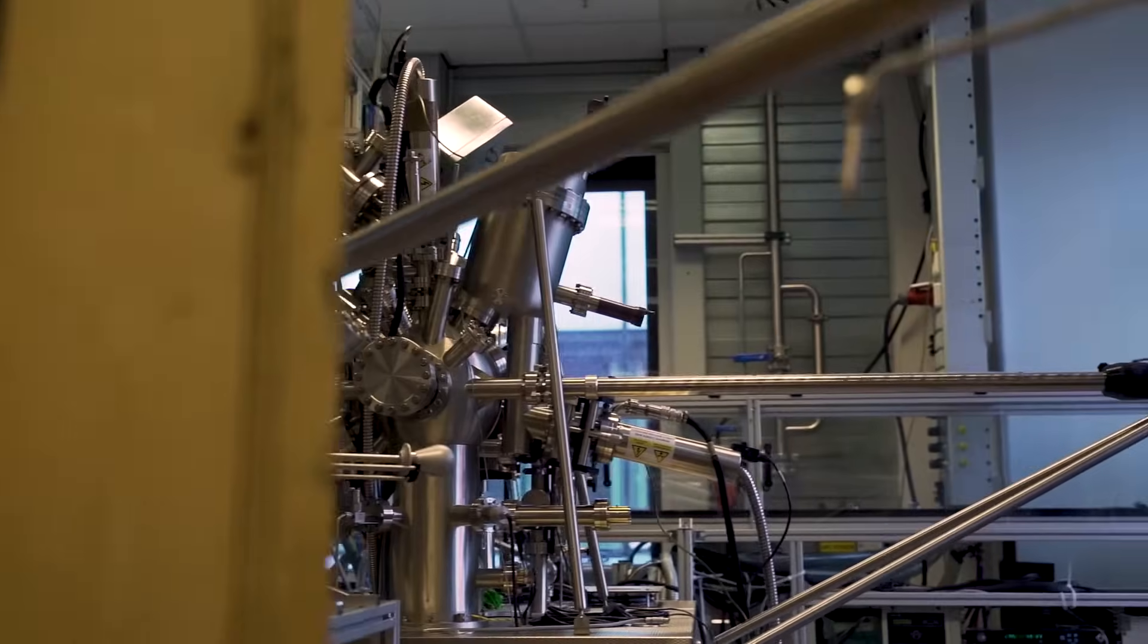Welcome to the study of nanotechnology here in Twente. In nanotechnology we do not only study theory but we also focus on practical courses where you learn how to make nanostructures and also to characterize them. One of the important courses in nanotechnology is Nanolab and in this video we will elaborate on this practical course.